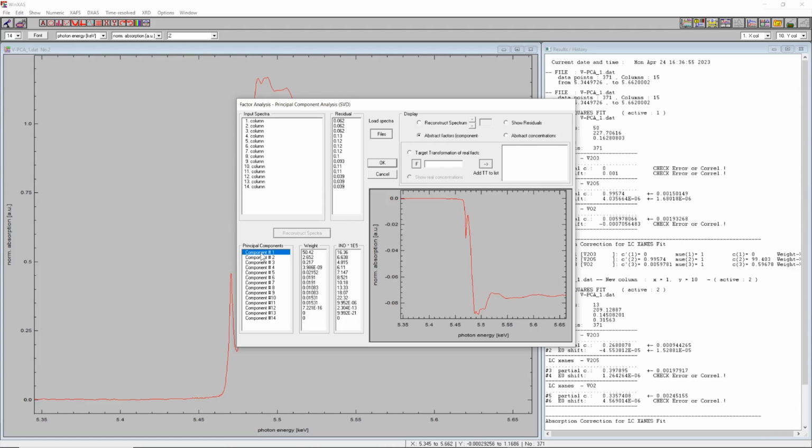So as I said, this number is basically a model 3 result. So far we have not used any references, we have not used any databases to just get to this result that tells us 3 components are sufficient to reproduce the experimental spectrum.